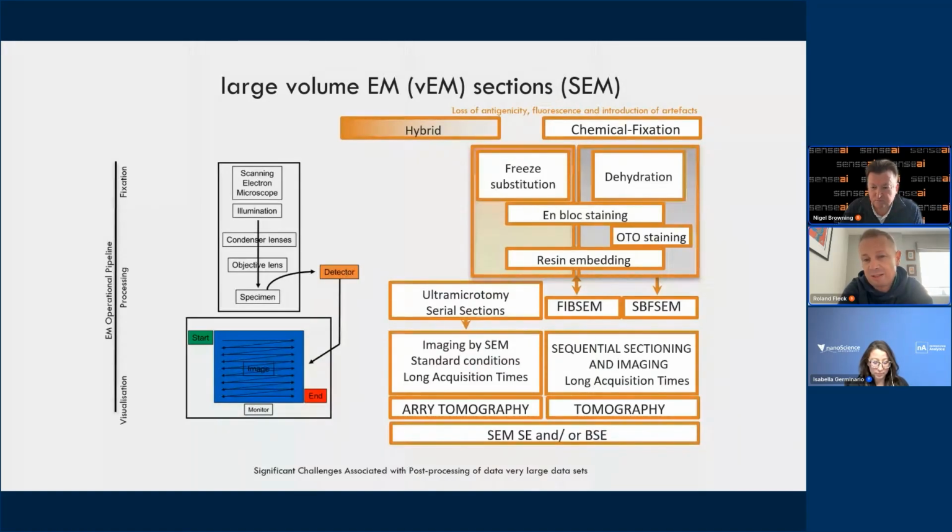Trying to keep a facility, a lab, stable for 12 months or longer with absolutely no interruption to anything is quite a challenge. Things happen, you have power outages, unforeseen events, even just a problem on the highway can stop staff coming in to maintain an instrument. So the shorter this acquisition period, the better it is for the end user.